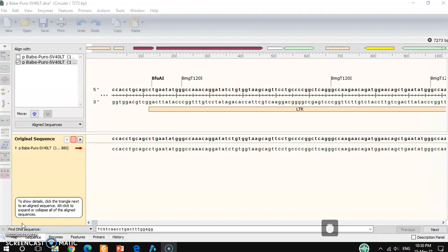There are different tools, offline and online, to make the alignment, and the important online tool is NCBI. Most people use NCBI for alignment purposes, but there are also offline tools. In my opinion, the offline tools are better for alignment compared to the online tools.